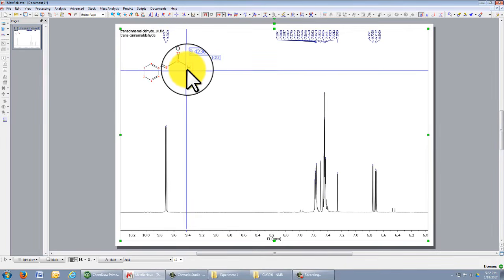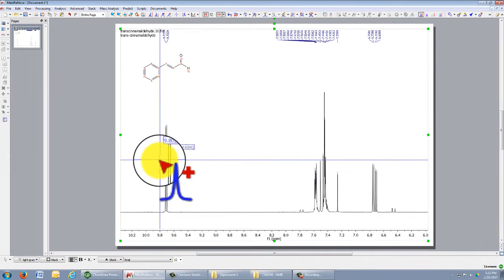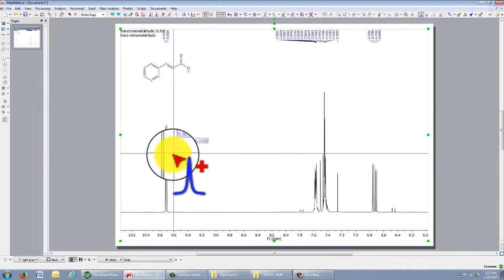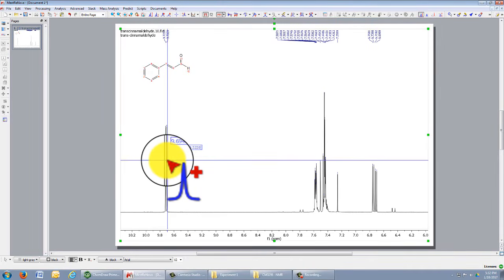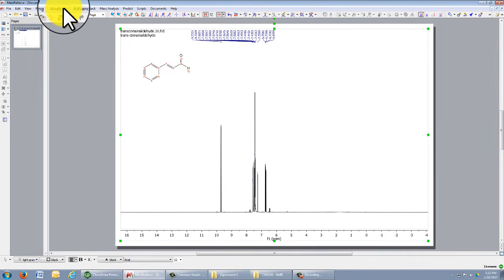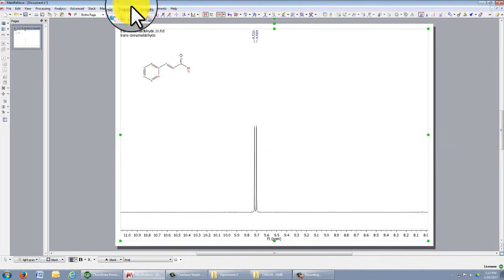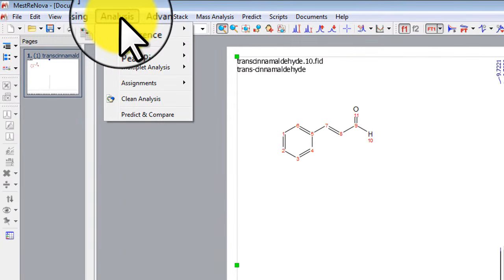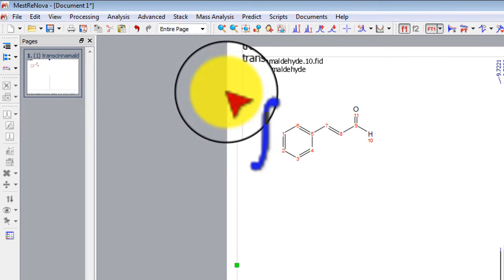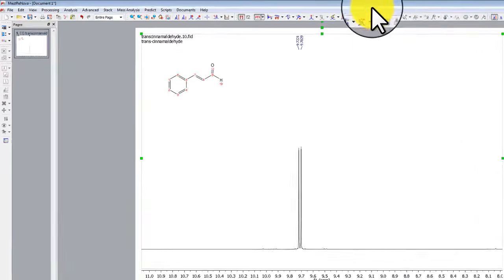Beautiful, isn't it? So now we know the aldehyde proton, the terminal carbon, is highly deshielded. It is at low field, downfield, and this signal must represent that. Okay, this position here. So first let's go to the full spectrum, what we see now. Before we do the integration, let's zoom in to the portion that we predict our signal represents the proton. Okay, we go to analysis, click integration, and select the manual way, because we know that this aldehyde proton, there's only one of them.